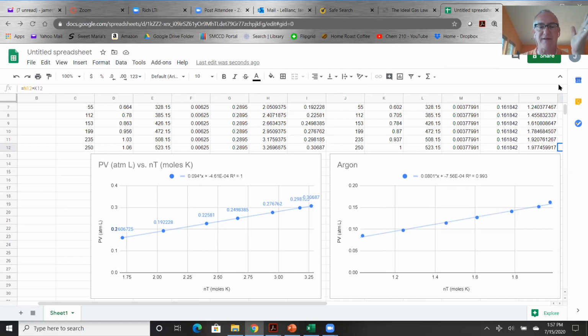There you go. You have to have them labeled, or else it's basically a worthless diagram, because we don't know what it represents. All that tells us is that this set of numbers matches this set of numbers. That's not useful information. Dr. Gagreb helped me edit this last night, and he was very insistent that the axes be labeled. I agree with him, so I put it in the instructions.